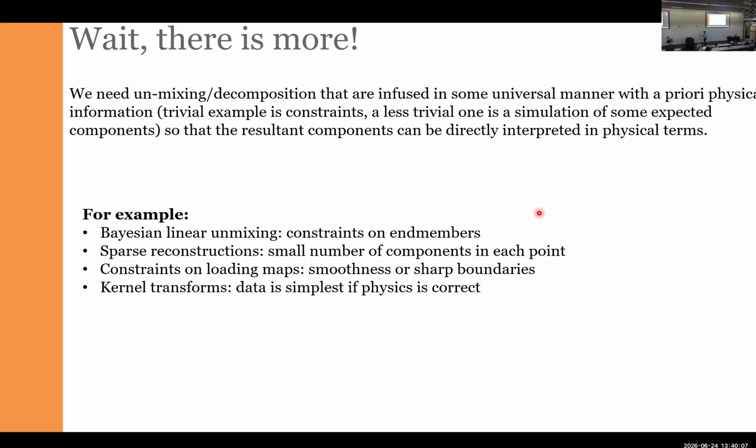It is now a given that you can take your data and, using a 10-minute interaction with ChatGPT, analyze it in 20 different ways. In fact, I put a notebook on the course GitHub that shows this analysis for EELS. So those of you that have a laptop in front of you can play with it. It practically illustrates how you can analyze the data in 20 different ways.